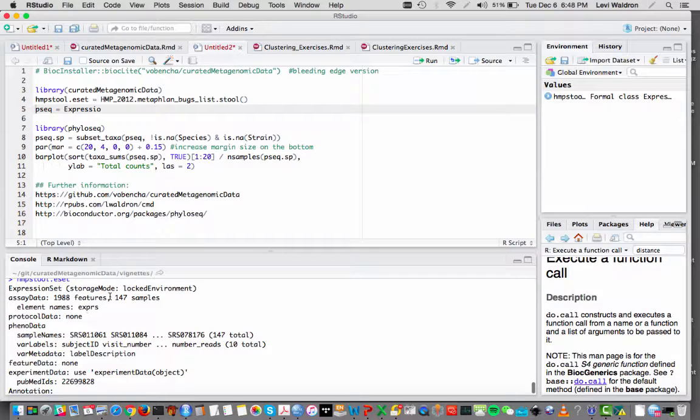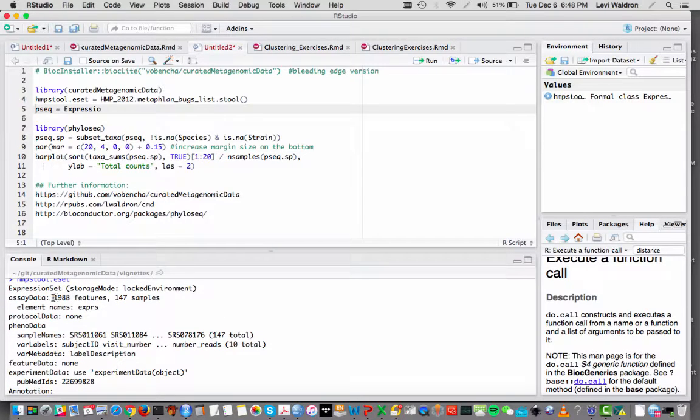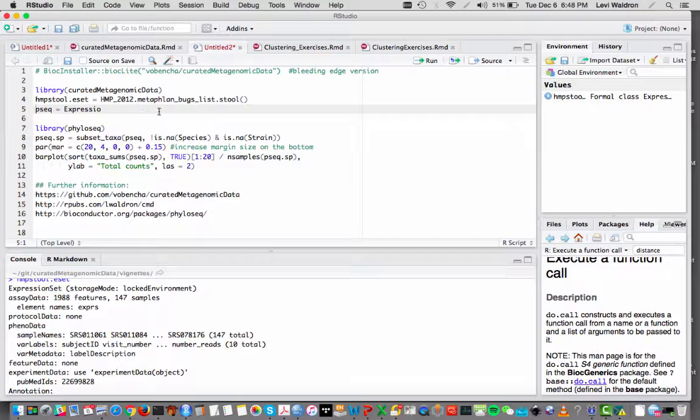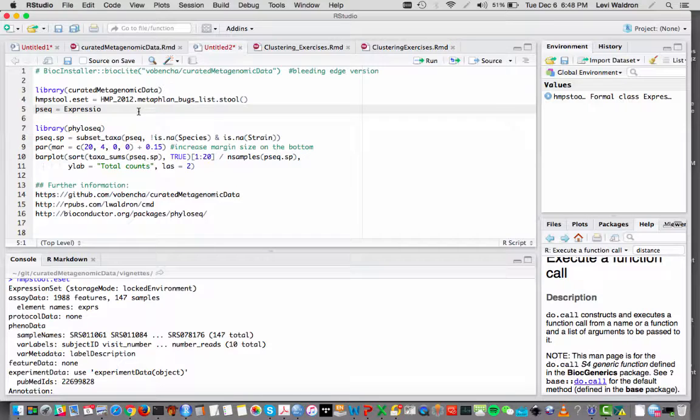It has 140 samples, 1,988 rows. That happens so quickly because experiment hub does automatic local caching and I have loaded this dataset before. So the first time you do it, it will take a little bit longer.